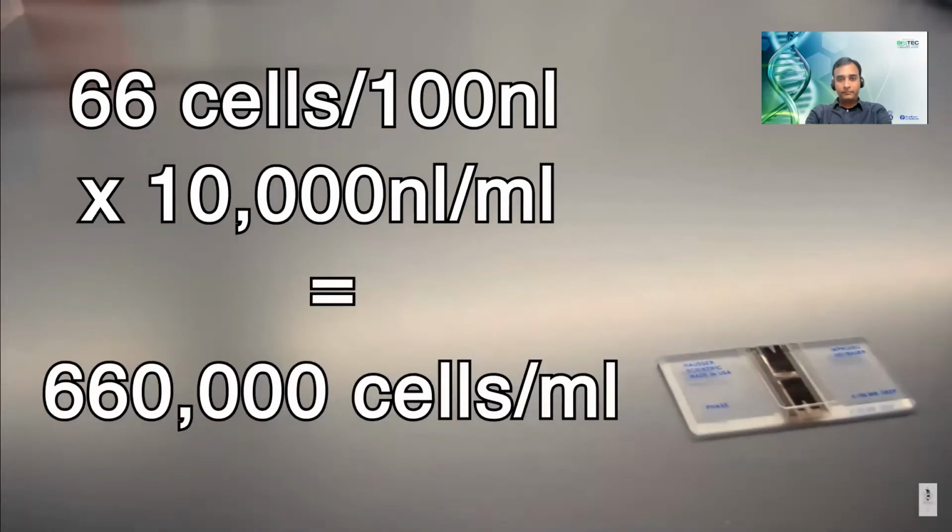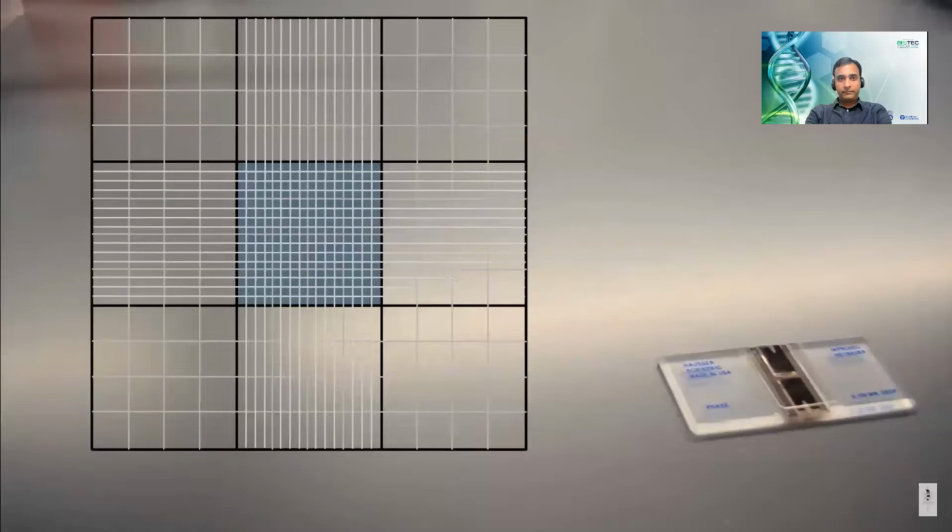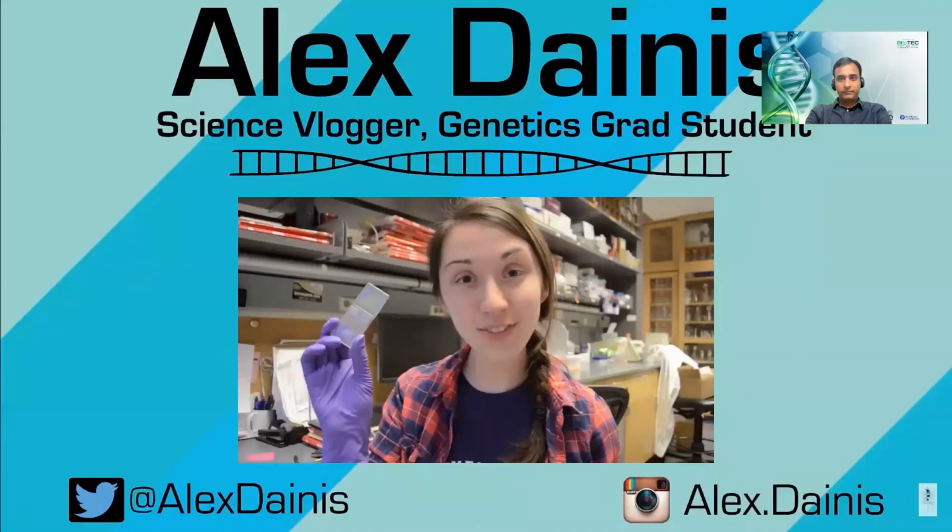If the mixture is very dense, you can use some of the smaller subdivided squares to help count and keep track of your cells. A useful tool for counting cells.